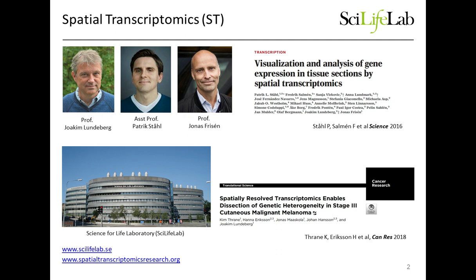I joined the group a little over 5 years ago, and since then I've been involved in various projects. One of them is a collaboration with Dr. Hanna Eriksson, where we use spatial transcriptomics to explore heterogeneity in cutaneous malignant melanoma. And we published a pilot study in Cancer Research last year. Hanna will share some more results from this study, but first I will talk about the concepts of spatial transcriptomics and how the technology has been further developed by 10x Genomics to become Visium.